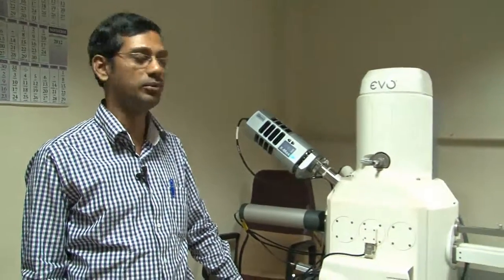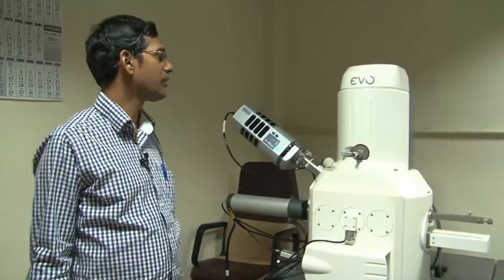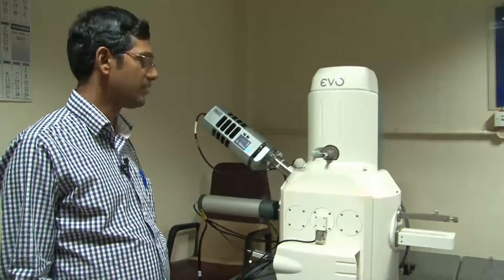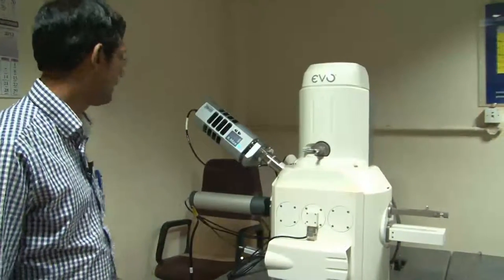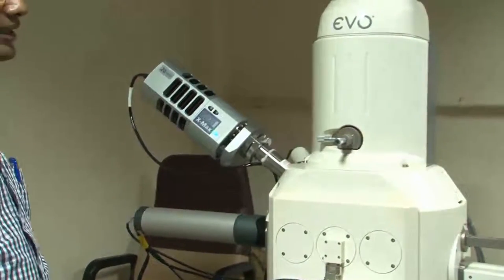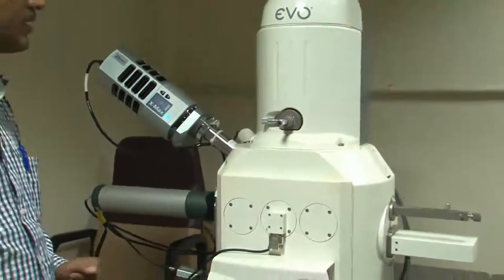Okay, so we are going to show you the real-time EBSD analysis which is available in IIT Kanpur at the Department of Material Science Engineering. This is a microscope which can do all kinds of EBSD analysis. The sample is loaded inside this chamber, and this is the EBSD camera which goes inside whenever we are required to detect the EBSD or required to do the EBSD analysis.